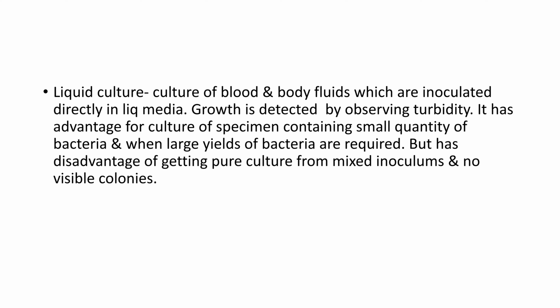Now is the liquid culture. Culture of blood and body fluids are inoculated directly into the liquid media. Growth is detected by observing the turbidity, and it has the advantage for culture of specimens containing a small quantity of bacteria and when large yields of bacteria are required, but has the disadvantage of getting a pure culture from the mixed inoculum, and as such no visible colonies are obtained.